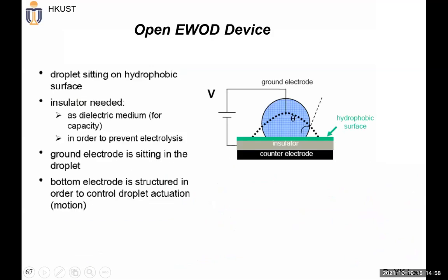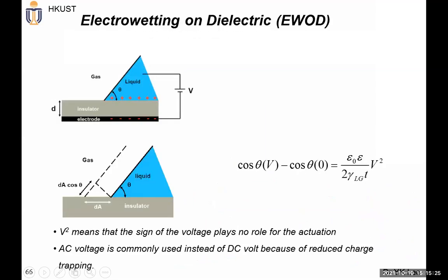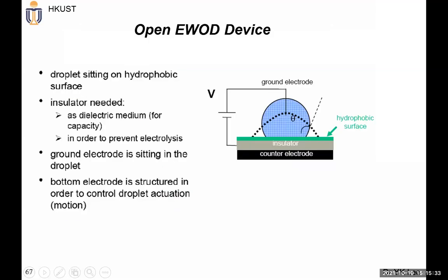Of course, there are at least 2 different designs of electrowetting device. Basically, on only one side you have dielectric material on the counter electrode, with an additional wire. And then of course we have an additional hydrophobic coating, to make sure we have a reasonably good contact angle when there's no applied voltage.